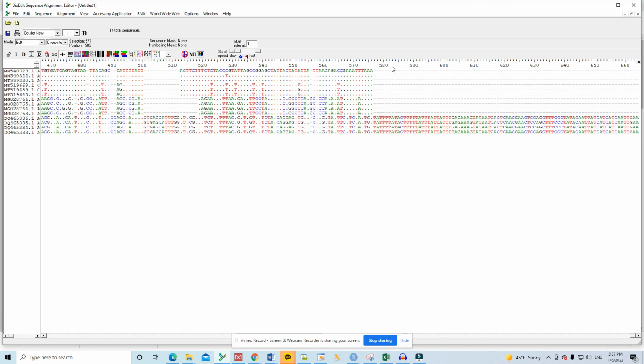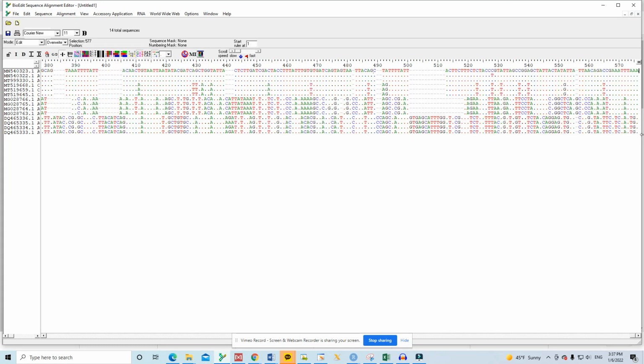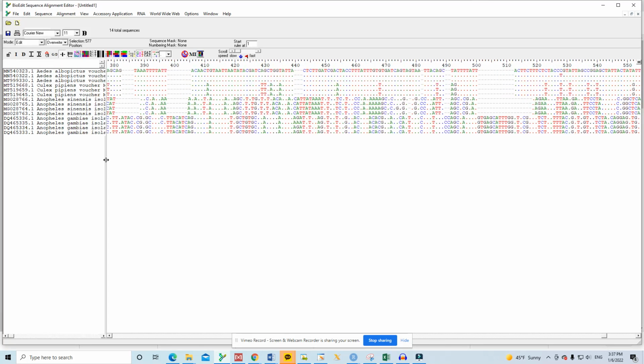Meanwhile, from the alignment, we should be able to tell a story about the sequences that we are analyzing. This is a blind analysis in the sense that I am not the owner of these sequences. I don't know the origin. These are just secondary data from NCBI, not original data.